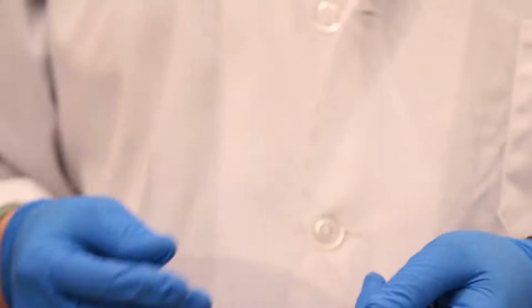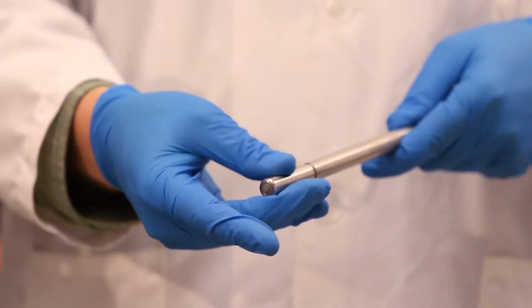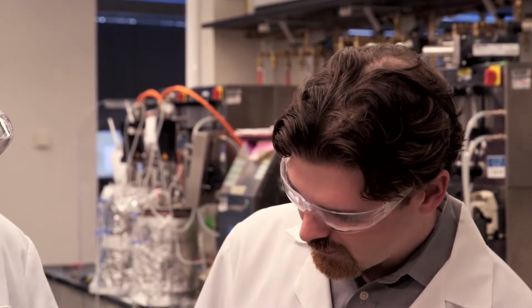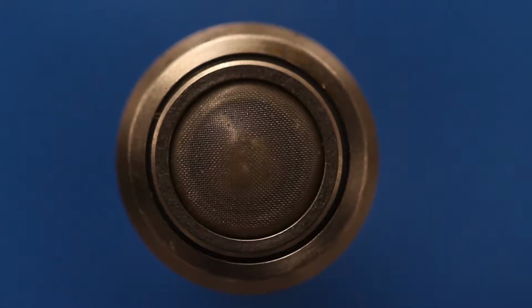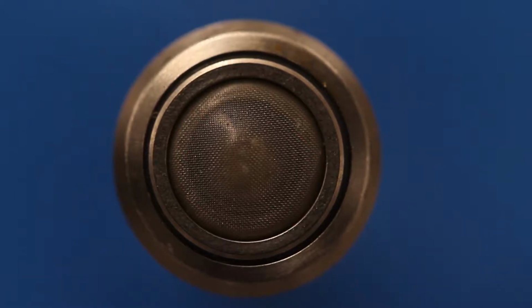Okay. Second probe is the dissolved oxygen probe. And this one's a little bit more interesting because you can actually take it apart. Unscrews at its base. What you see then is an actual sensor. I see. So this is where it actually measures the oxygen. Exactly. And it goes through just a little membrane at the base of the stainless steel housing. Okay. And across that surface is how we're actually able to measure oxygen dissolved in liquids.